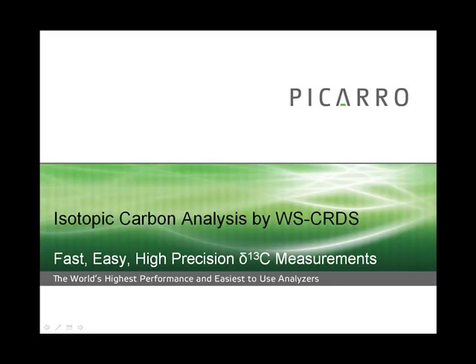Welcome to part 3 of our series focusing on isotopic measurements using wavelength-scanned cavity ring-down spectroscopy. This webcast introduces isotopic carbon analyses, fast, easy, high-precision measurements of delta 13C from solids and liquids.